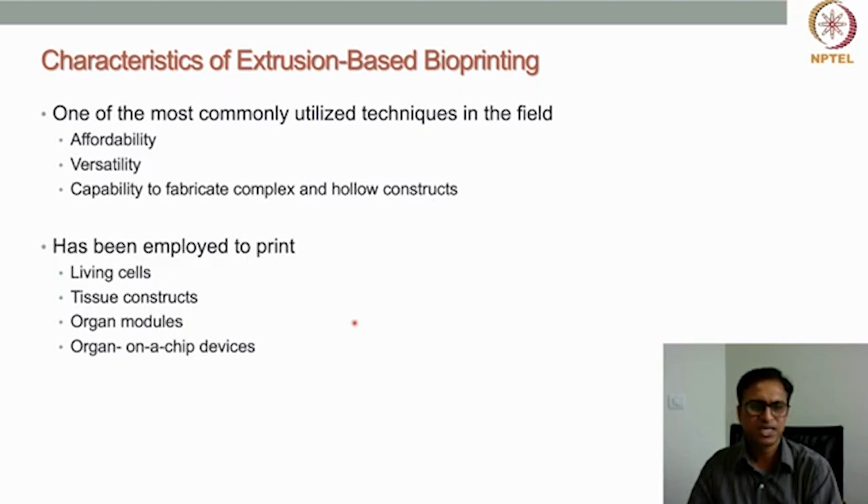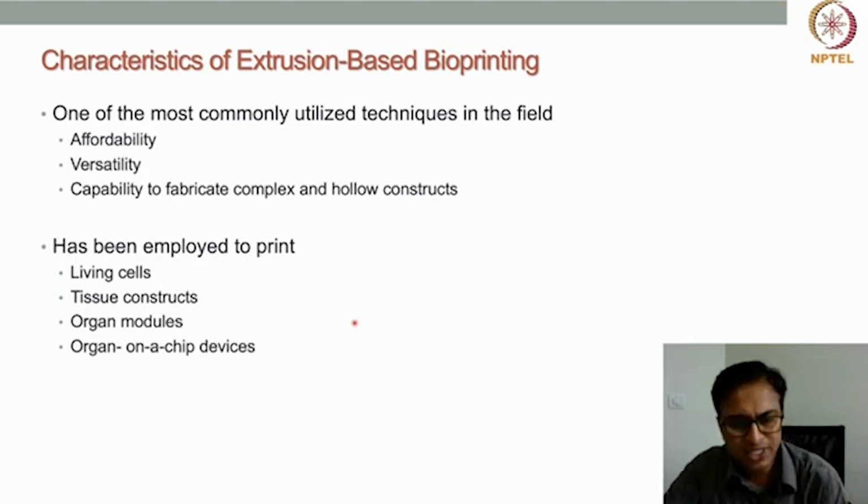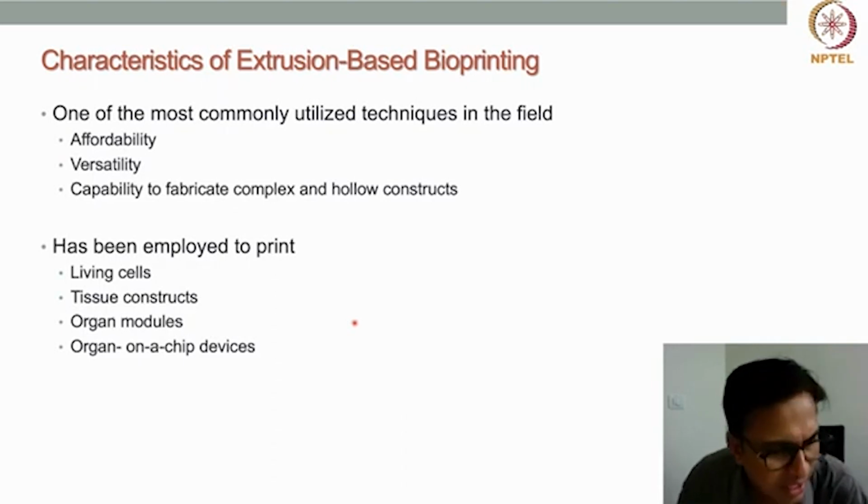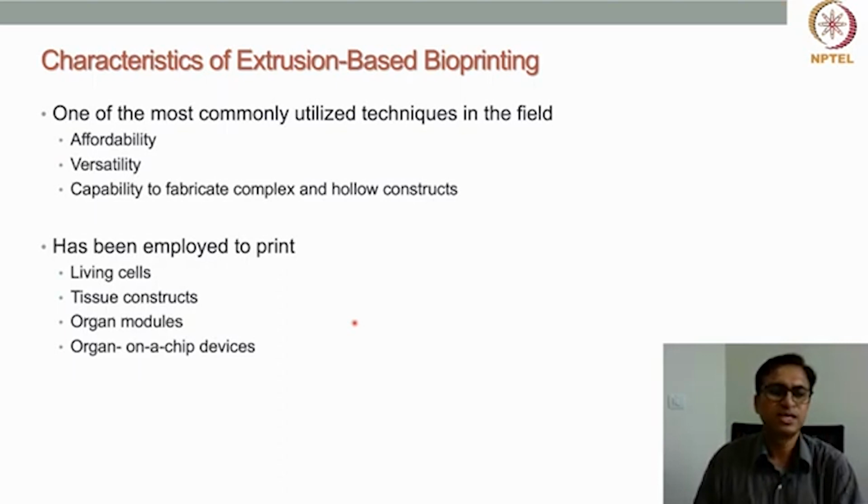These printers are not very expensive nowadays, and the working principle is also very simple, so many people, including researchers, can work on this technology.